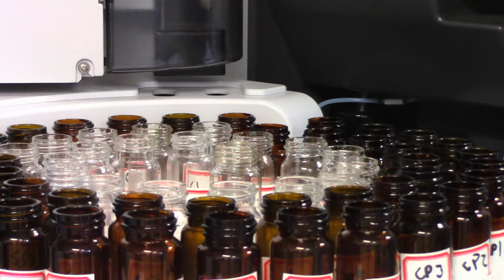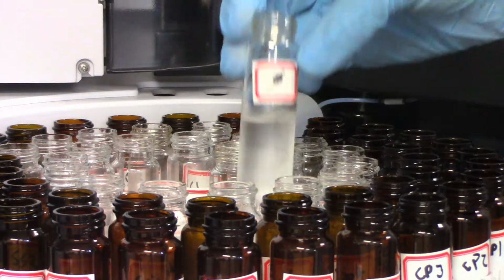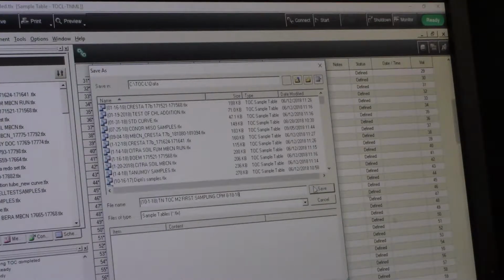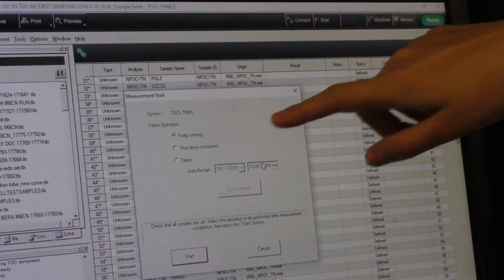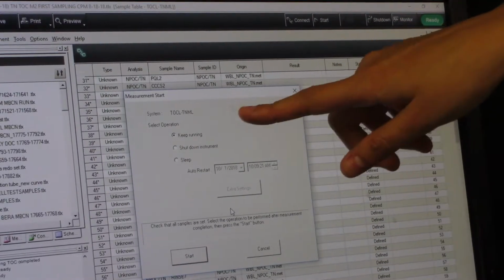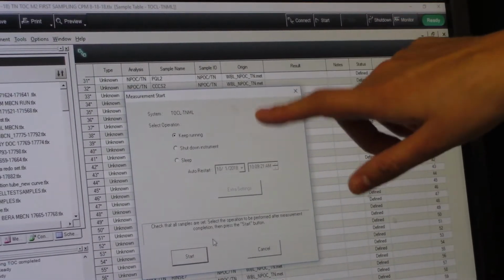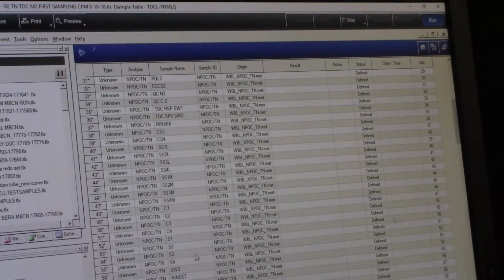Analyzing your samples in the TN-TOC is only the first step in getting your results. The raw dataset will still have to be formatted and organized using pre-made Excel tables. Sophia, our lab manager, will demonstrate how to convert raw data here, using a student's results as an example.